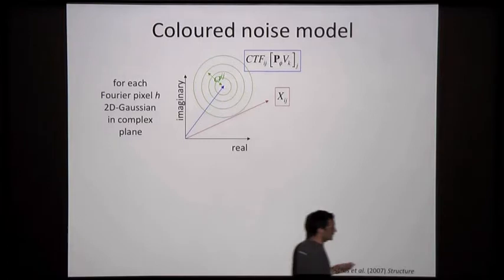Now the neat thing of Fourier space is, because we know, and we saw this in several of the lectures before, that the signal to noise ratio in your images decreases as a function of the spatial frequencies. So as the images contain finer detail, they become noisier, and the low frequency information is still relatively low in the amount of noise.